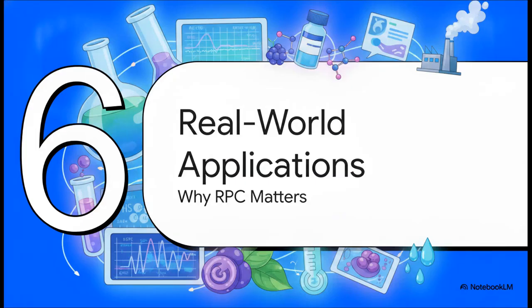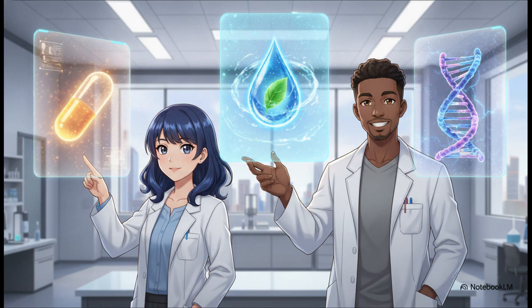Finally, let's wrap up with Section 6, Applications in the Real World, Why RPC Matters. Whether we're talking about pharmaceutical scientists isolating purified peptides for vital drug purity testing, environmental labs analyzing pesticide residues and industrial pollutants in our groundwater, or advanced clinical laboratories performing critical biomarker analysis, RPC is the absolute workhorse. This molecular obstacle course is the silent guardian making modern quality control and biological discovery possible.